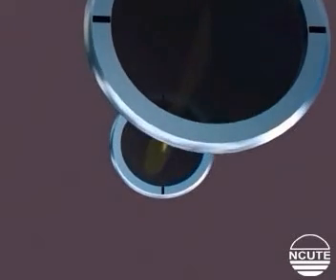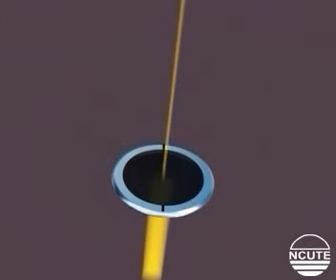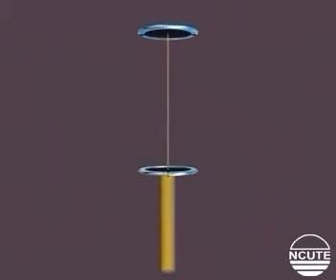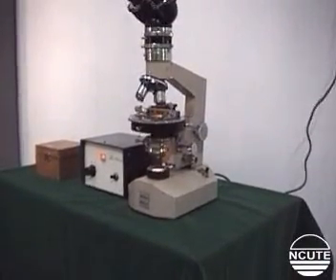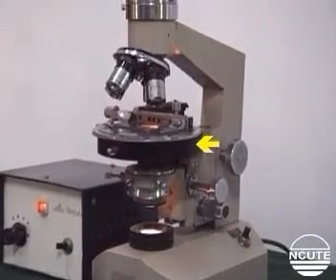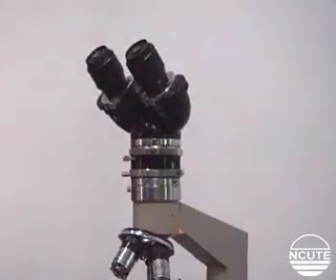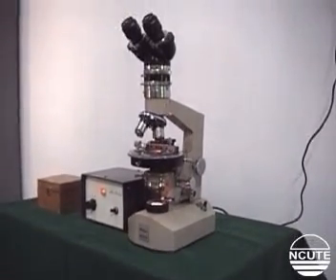Now take a look at this arrangement. The light source is at the bottom, the polarizer is above it, and the analyzer is uppermost. This is exactly the optical arrangement in a polarizing microscope. Now here is the polarizing microscope. Note its main parts, namely the light source, the polarizer, the stage to place a glass slide with fiber specimen, the objective, the analyzer, and finally the binocular eyepiece. All of these components except the light source can be rotated to any desired position.